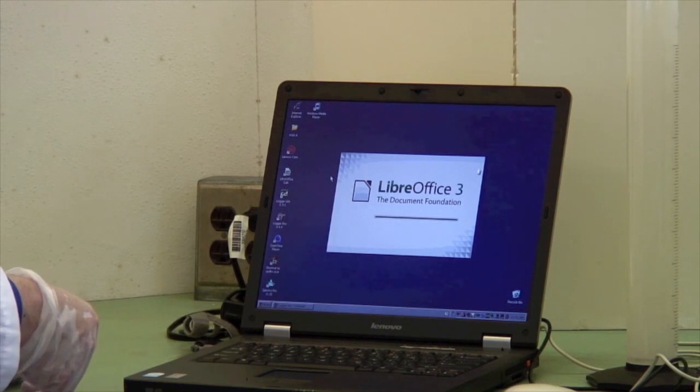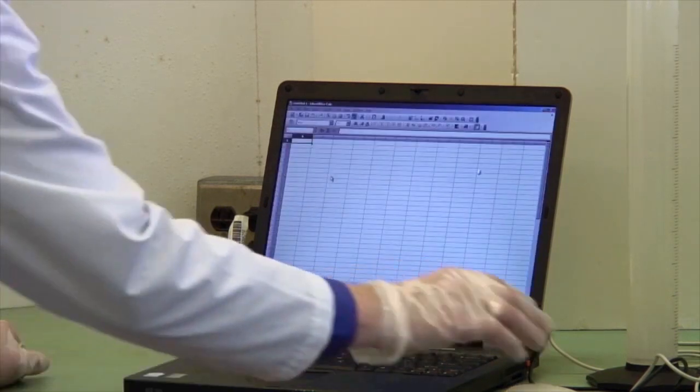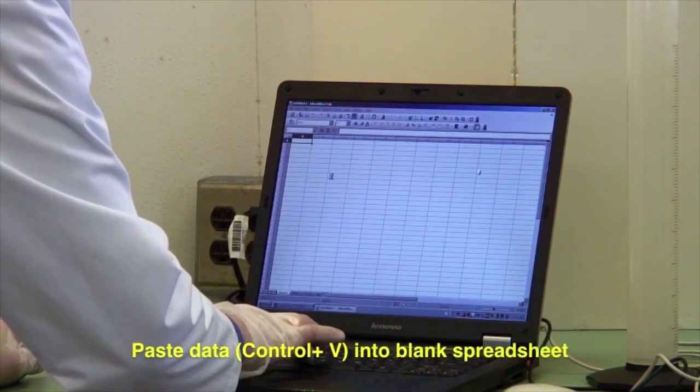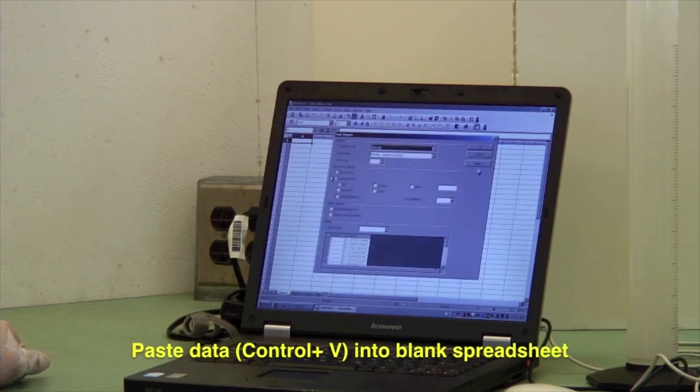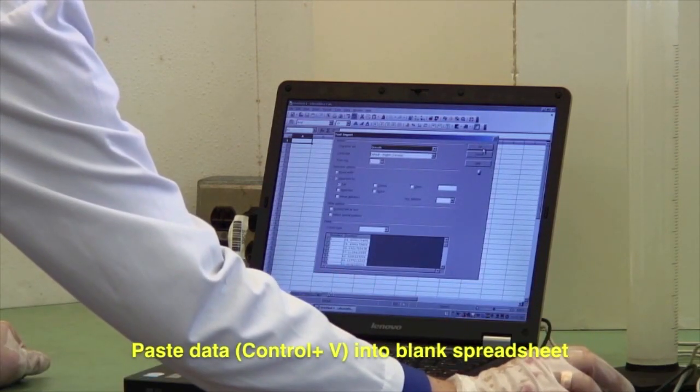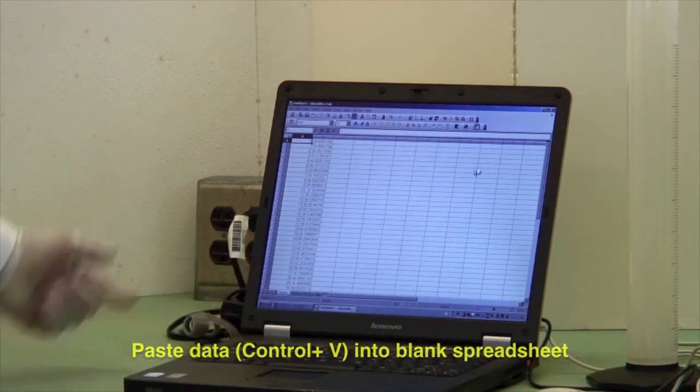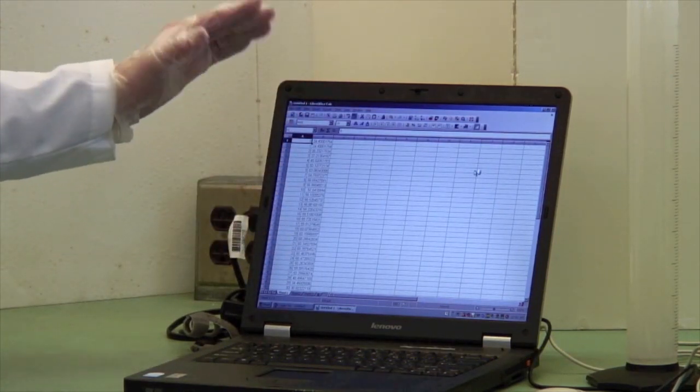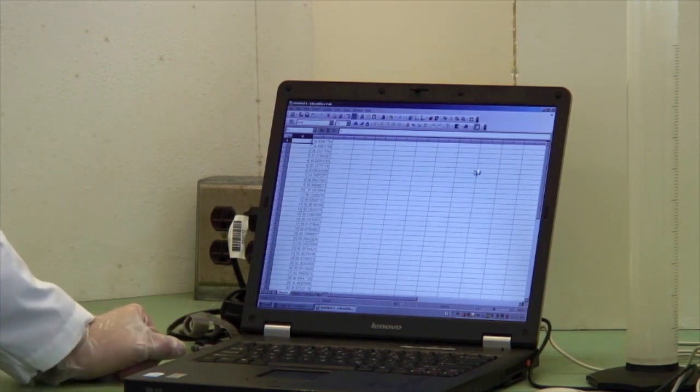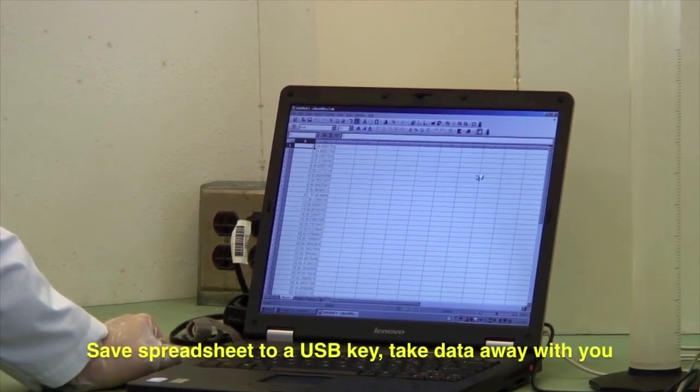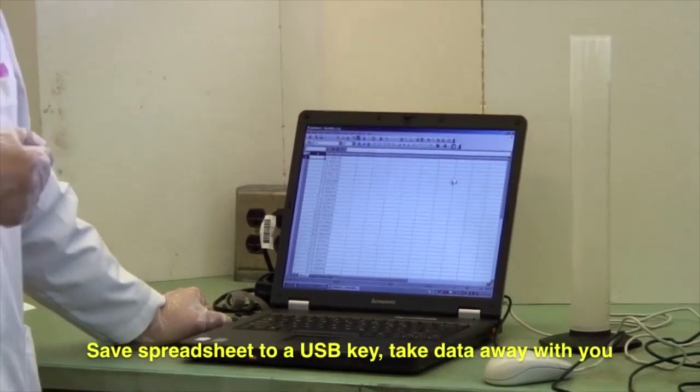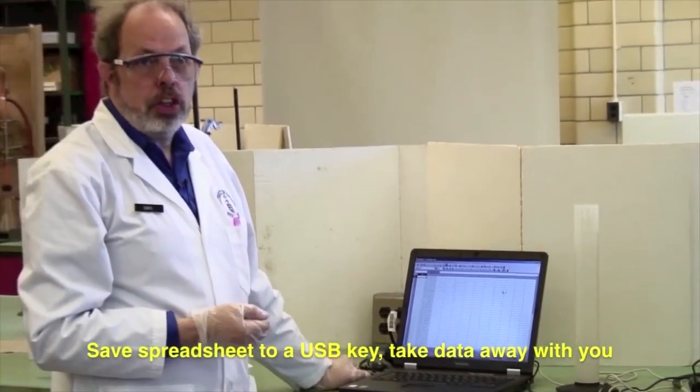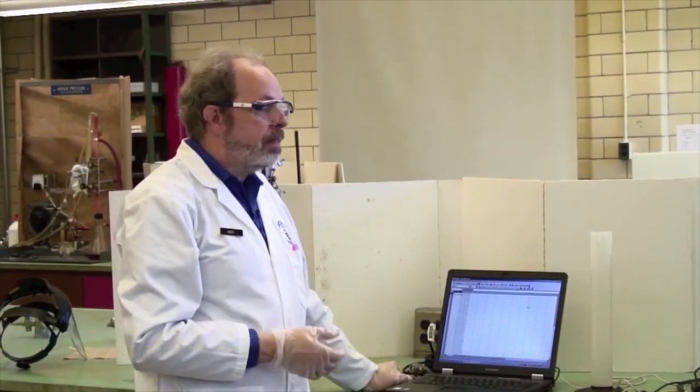Control V. And there we have temperature as a function of time. And you can save this and eventually export it into a USB key that you can then take home and crunch the numbers with. So that's it for calibrating the calorimeter.